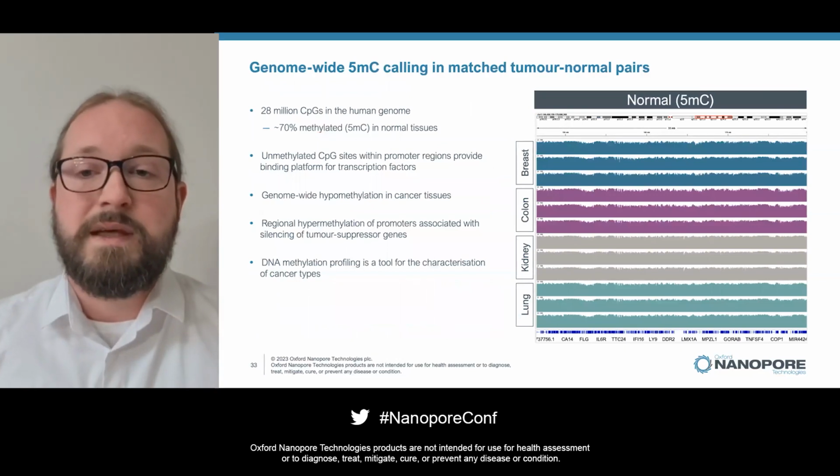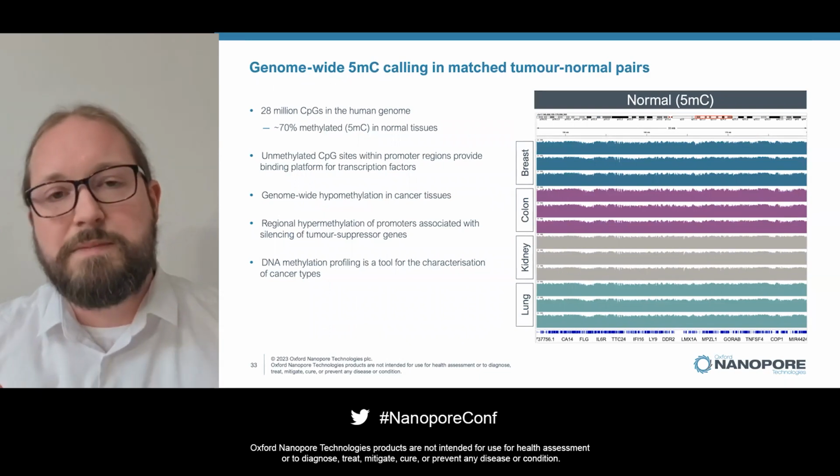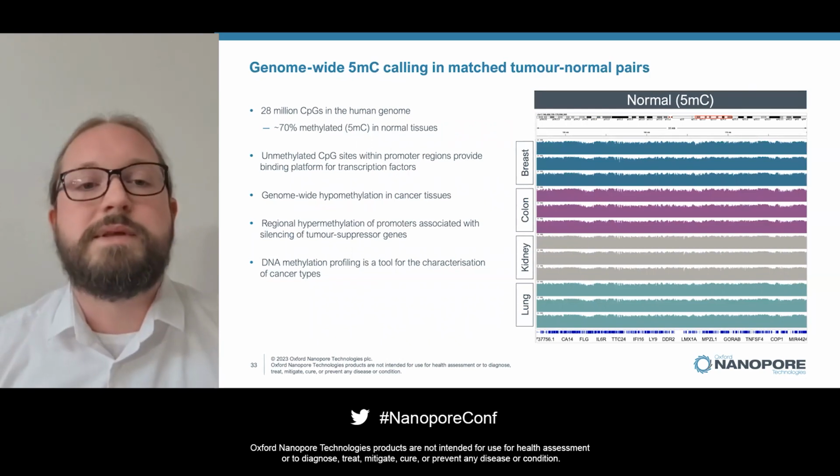And so why am I doing this? First of all, this is to me some kind of game changer really in terms of Nanopore. If you run a Nanopore cancer data set, you get the modifications. If you don't, if you just do it the way we just told you.